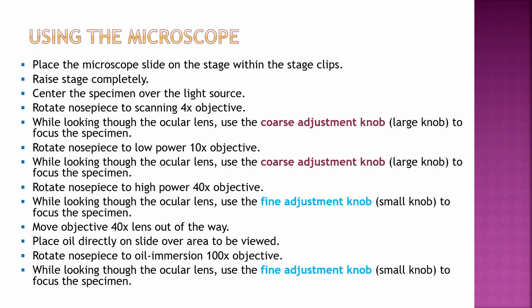And while looking through that, you're going to, again, use the coarse adjustment knob as well as the fine adjustment knob if you need to get it in better focus. Then you're going to move over to that high power 40x objective. Now you are only going to use the fine adjustment knob.